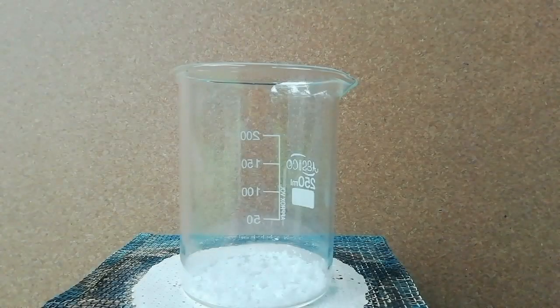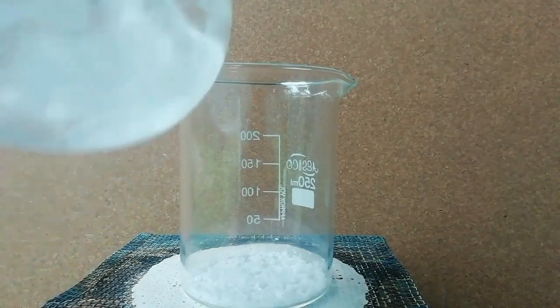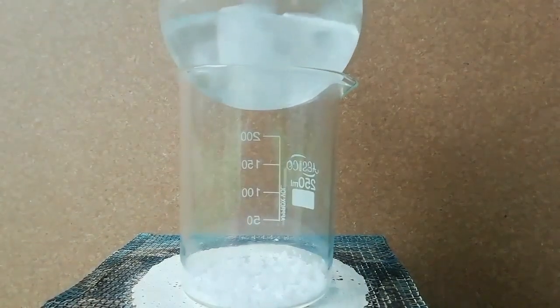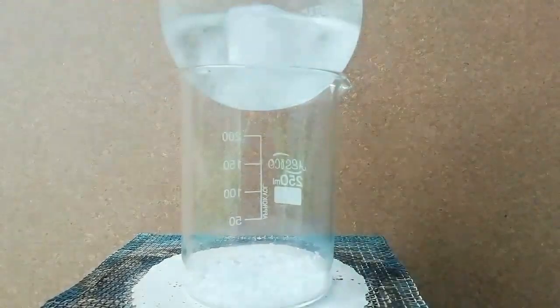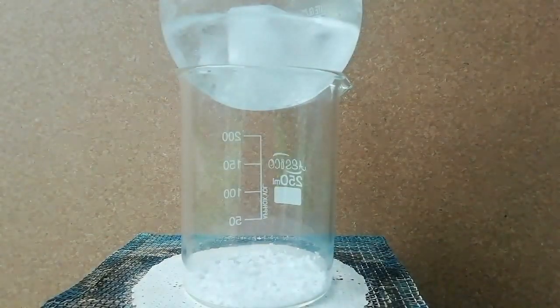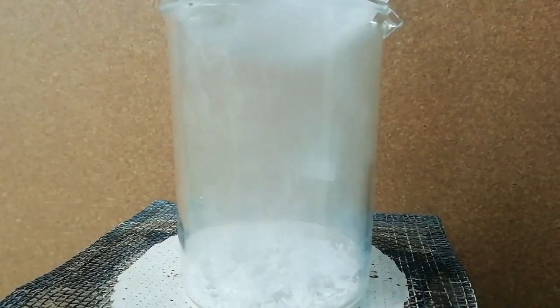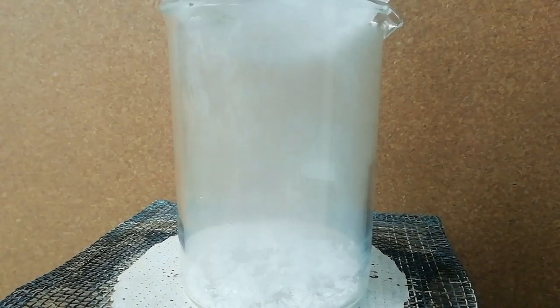First, 2 grams of thalic acid is placed in a 250 ml beaker. Then, I set a round bottom flask filled with ice and water to solidify the acid vapors.